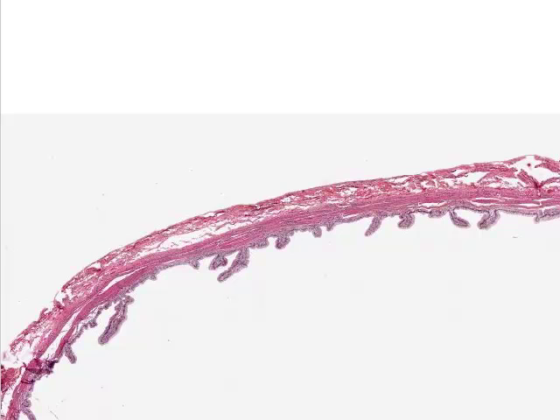Finally, to complete our study of the liver histologically, let's take a look at a small structure that's associated with the liver, is in fact adherent to the liver, and this is the gallbladder. And histologically it really couldn't be much simpler as organs go. The function of the gallbladder is to store and to concentrate bile.